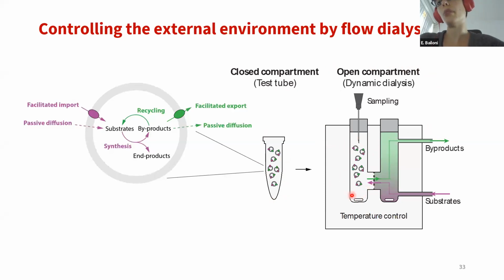And by that, I mean a compartment where the vesicles could be separated by a dialysis filter and always be in contact with a fresh feed of substrate, so that the vesicles could be retained, but the substrate could always flow and equilibrate across the dialysis filter into the vesicle chamber, so that similarly the waste products produced by the vesicles could be washed away through the feed.